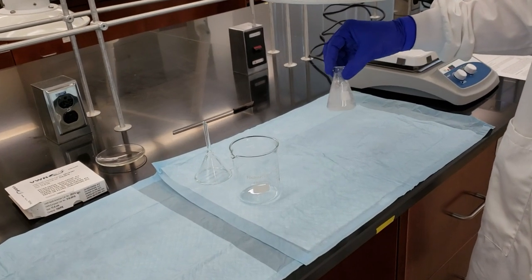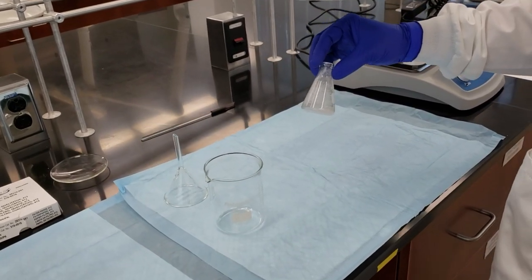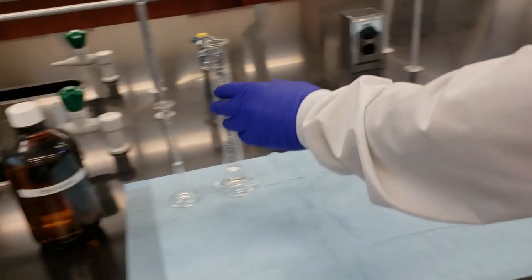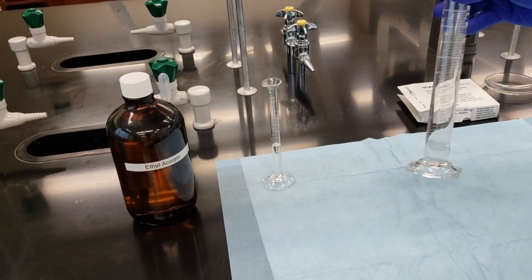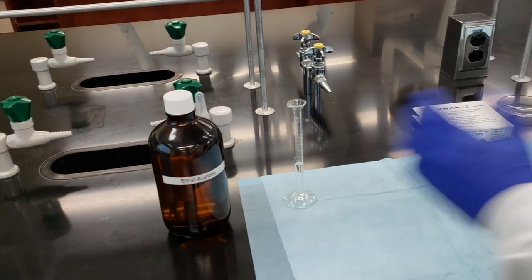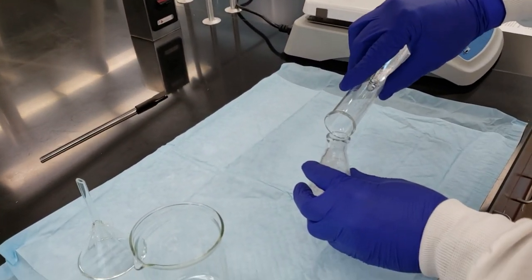Our reaction has finished swirling. It's been about 10 minutes. We're going to go ahead and start our extraction process here. Set this down briefly. We're going to take 10 milliliters of ethyl acetate and pour that into our 50 mil Erlenmeyer.